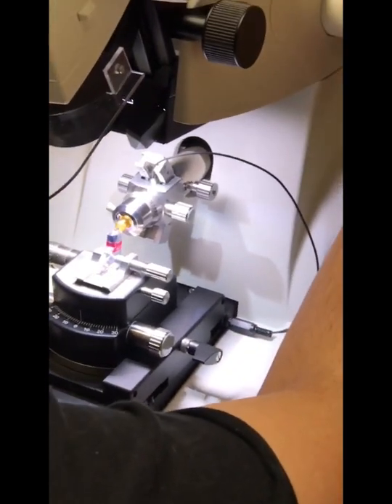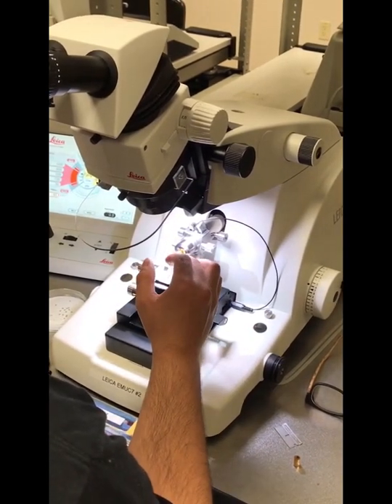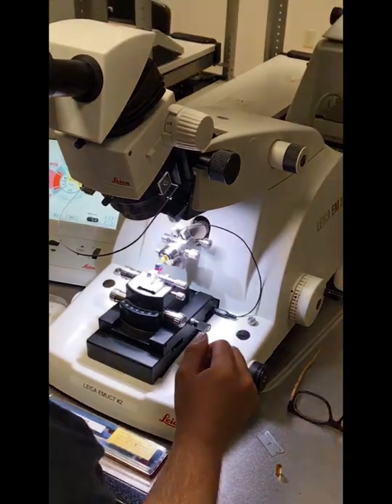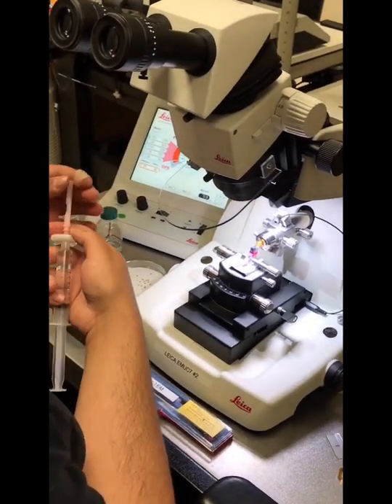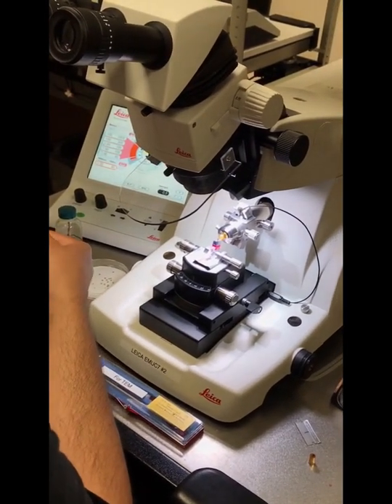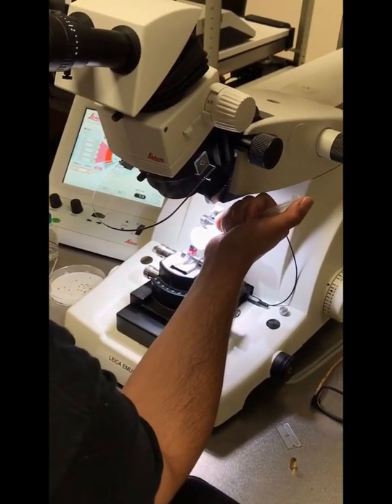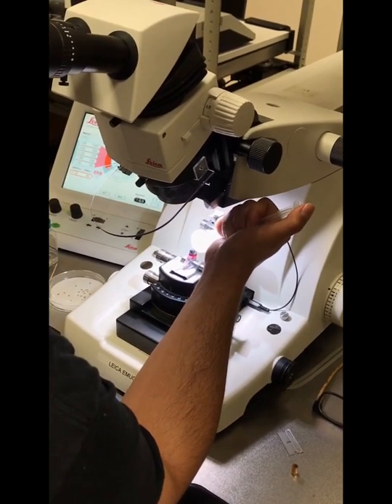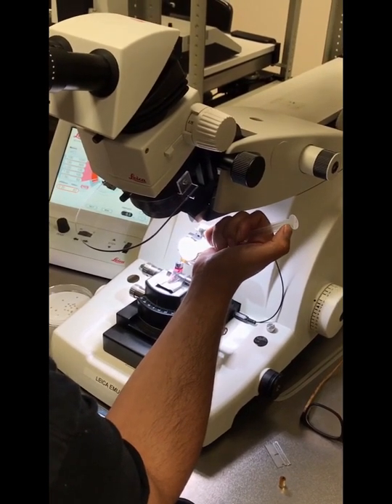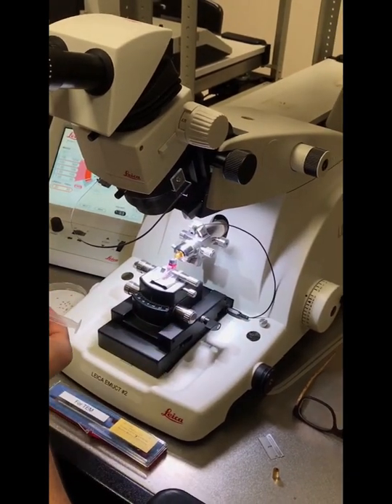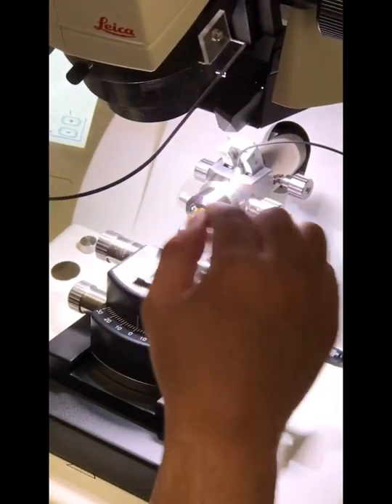Okay, so after your adjustments are all made and you can clearly see your knife, the boat reservoir, and the block, then you can begin. So the first thing I'll do is I'll fill up the boat with deionized water. And you want to fill it up just until you can see a shiny reflection on the surface of the water.